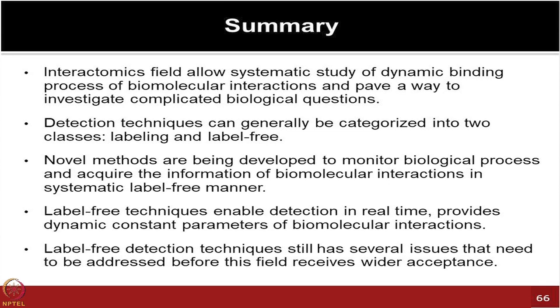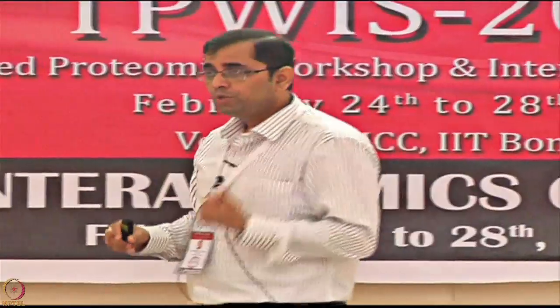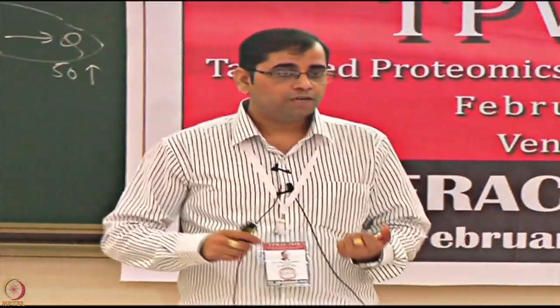I'm sure overall you are convinced that there is a lot of potential in using these label-free technologies and the different platforms available, starting from conductance-based principles, reflectance-based principles, to interference-based principles. Many of those could be utilized. You can choose which platform can be useful for your kind of application.